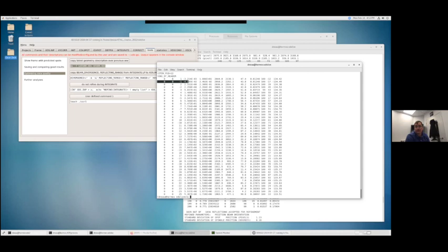Good, I answered that. Yeah, you anticipated it. And so on Wednesday, when we start looking at pointless and aimless, Kay will show you how to read those in to pointless, and then pointless gives you a format that Scala or aimless can look at.